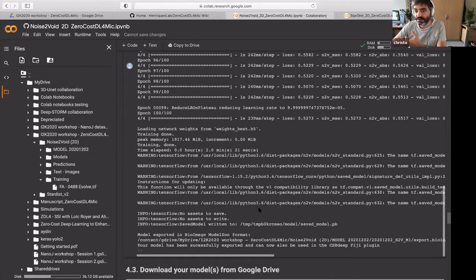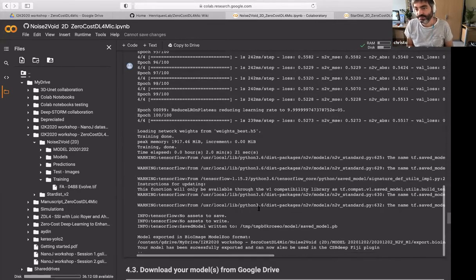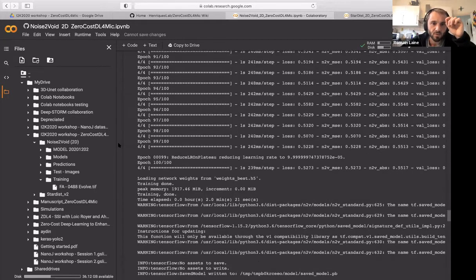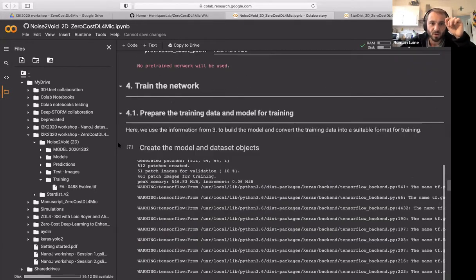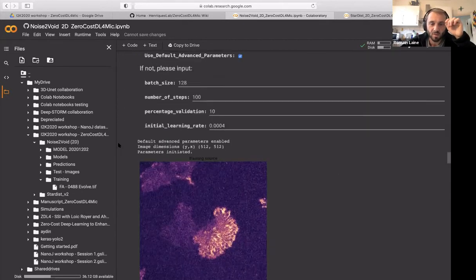For something that takes like 2 minutes, like here, it's not a problem. But if you start to train for hours, it can be useful to see that something goes wrong and stop it before you wait for the end of the training. Mm-hmm. Yeah, no, that's a good point. We can put this on the list of things to implement for our next release.